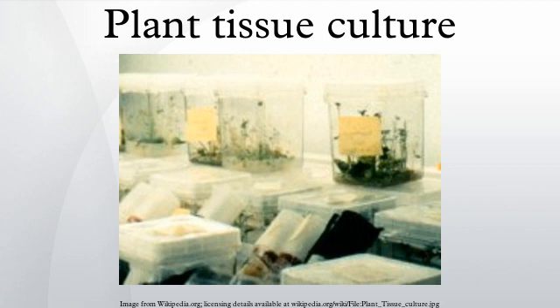These tissues have high rates of cell division and either concentrate or produce required growth-regulating substances including auxins and cytokinins. Shoot regeneration efficiency in tissue culture is usually a quantitative trait that often varies between plant species and within a plant species among subspecies, varieties, cultivars, or ecotypes. Therefore, tissue culture regeneration can become complicated, especially when many regeneration procedures have to be developed for different genotypes within the same species.